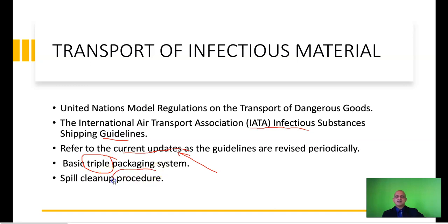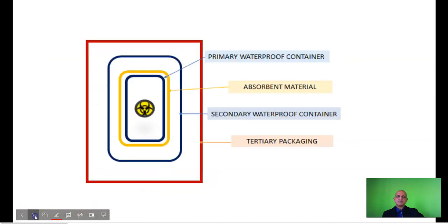And you must ship the consignment along with a spill cleanup procedure. However, this is highly unlikely as the material is triple packaged, but you must still expect or anticipate this possibility of a spill and cleanup in the lab or in the aeroplane or in the shipping system. Okay. This is a basic triple packaging.